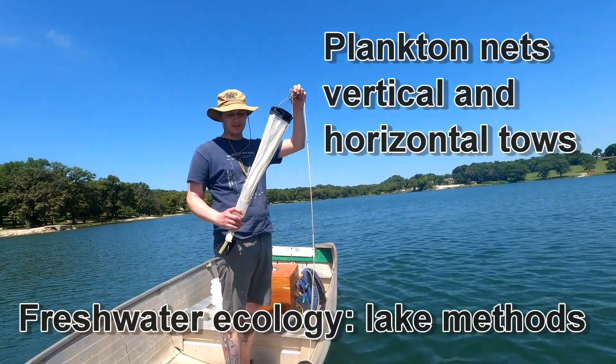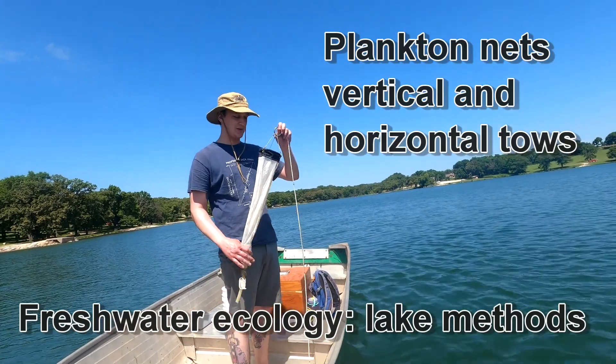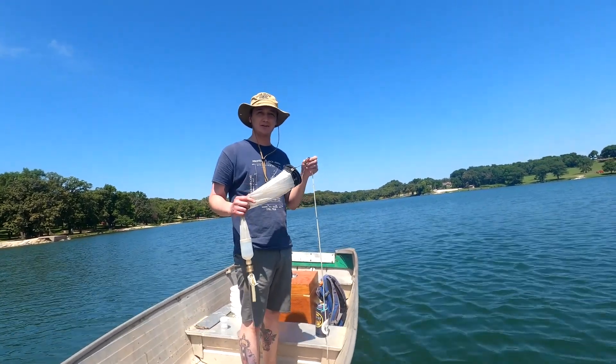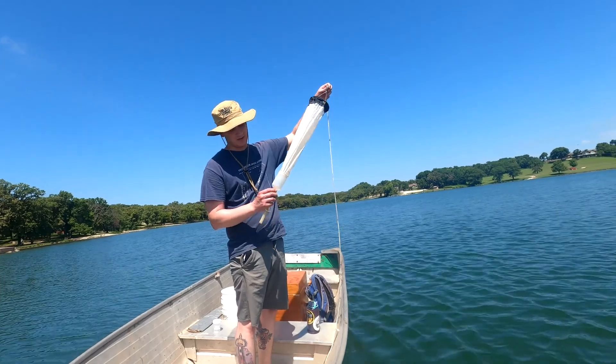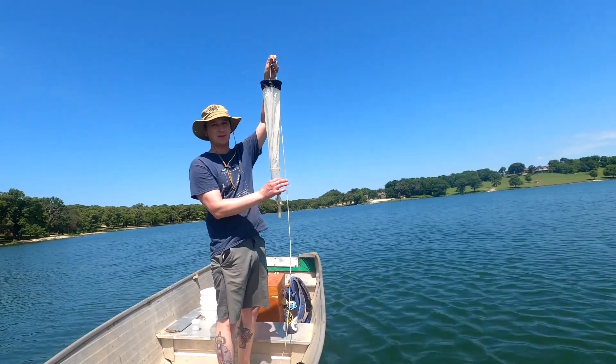This is called a plankton tow net and we'll use it to sample zooplankton or phytoplankton at depth. The mesh size of this mesh here is going to vary depending on what you're trying to sample — a little bit larger for zooplankton and smaller for phytoplankton. It's got a bottle at the end so everything that gets pulled down through the net will get trapped in the bottle.